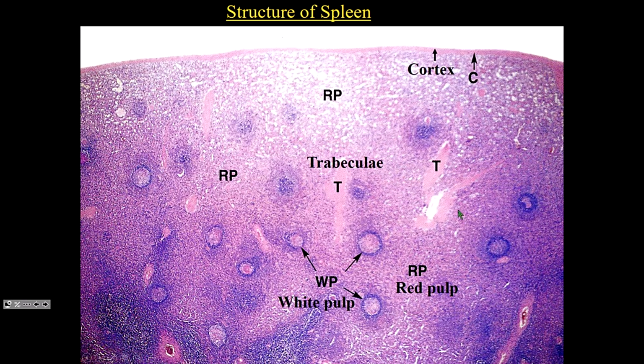So if we look at the structure of the spleen, it's encapsulated connective tissue on the outside, and we describe the spleen as containing red pulp and white pulp. So red pulp contains erythrocytes, red blood cells, no nuclei, they're stained pink, right, no nuclei. The white pulp contains an abundance of leukocytes, nucleated components of the blood. So the nuclei stain purple with hematoxylin, so that's why you get this purplish color of the white pulp. White pulp is referring to white blood cells. Red pulp, white pulp.